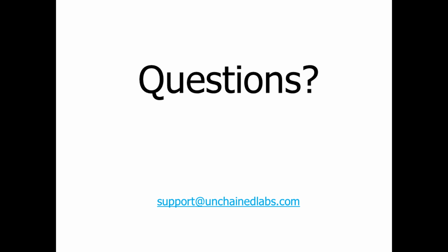Perfect. Thank you. Can this Design Creator be configured for customized systems? Well, I think with that I'd say that all of our systems are customized to some degree. There's very few cases where systems have gone out identically. My short answer is it depends. The way that we're doing the upgrade path is to come through the support line. We look at your system and just double check that it is compatible. So we do that before we install.